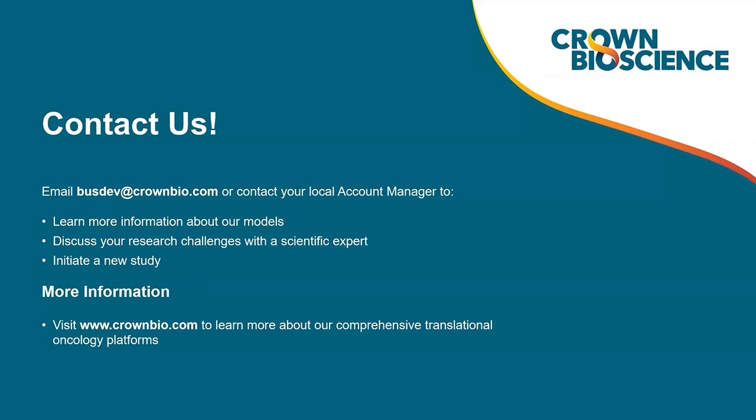And the next question that we have. Do all proteomics data at Crown Bioscience employ the separate then run protocol? Yes. We have utilized the 4D-DIA platform to measure proteomics data for over 200 PDX models and several mouse genetic models. For all these models, we removed mouse cell content before conducting proteomics profiling.